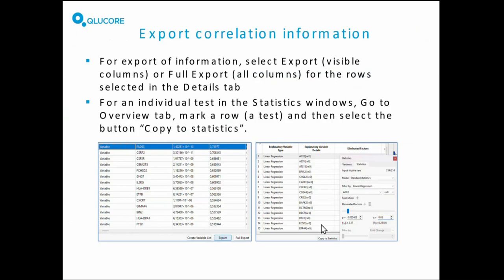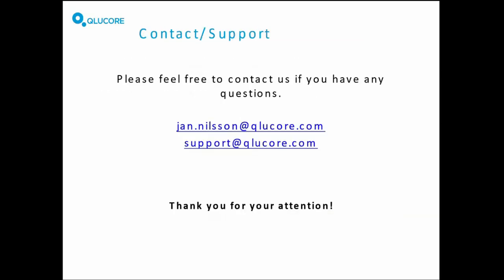So now we have seen how we can use the biomarker workbench for easy multi-omics, where we do correlation analysis on many proteins in this case towards the transcriptomics data that we have. It's two separated data sets where we use the transcriptomics data, which is likely to be the bigger one, as the data set, and we're using the proteomics data set as sample annotations to do linear regression in between a protein and all the genes in the data set. And we can work in the biomarker workbench in batches of around 100 proteins.